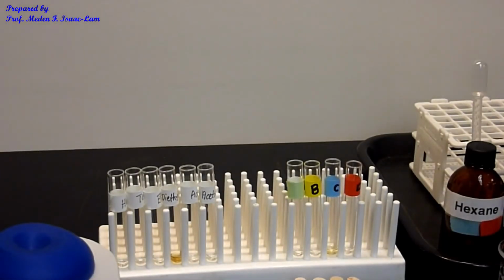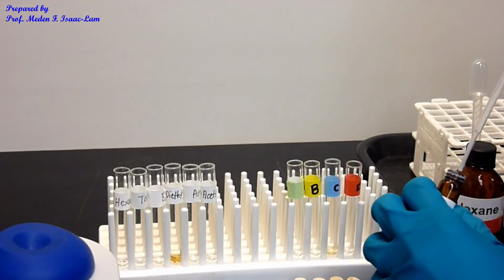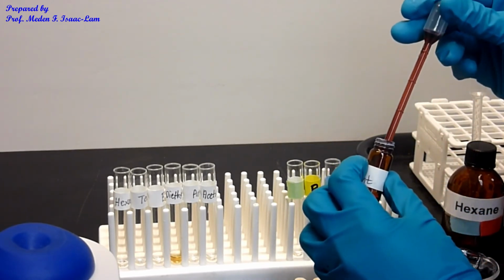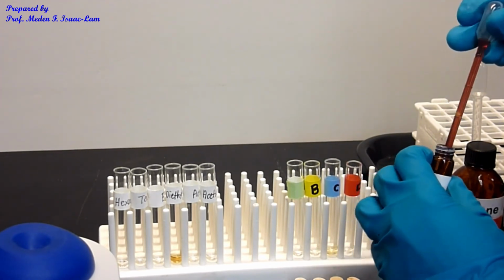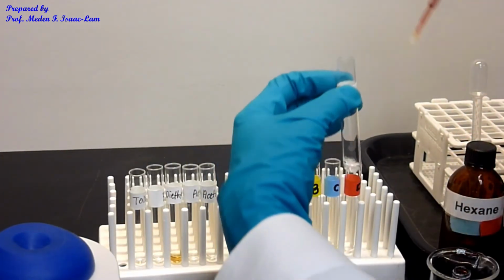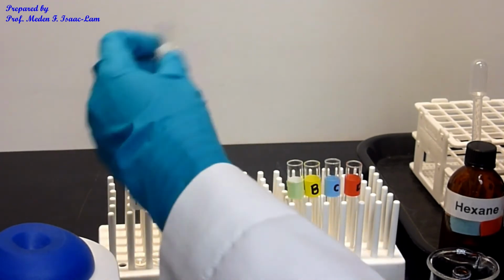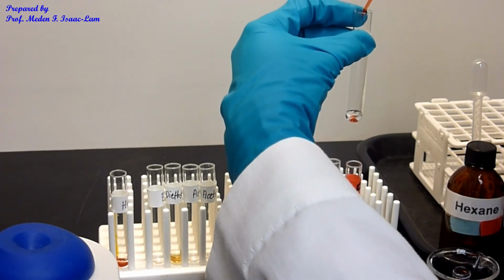Okay, all right. So then I'm just going to add 3 drops of the reagent. So this is the Jones reagent here. So 3 drops. This reagent is actually orange in color. It has chromium in it, that's why it's orange. So I'm gonna add 3 drops on each and observe. 1, 2, 3. Okay. 1, 2, 3.